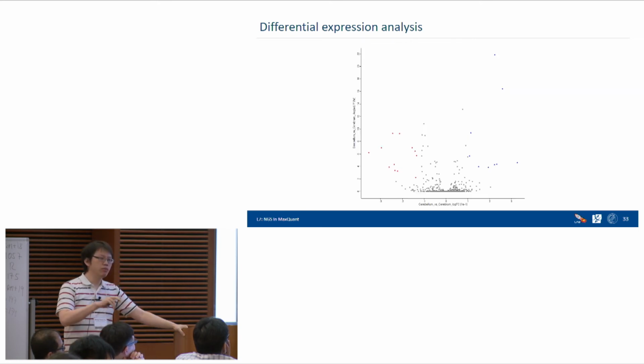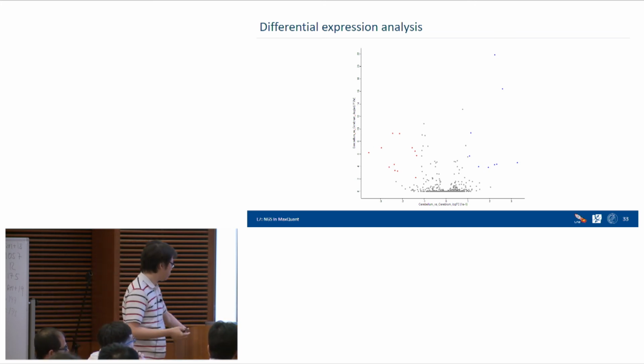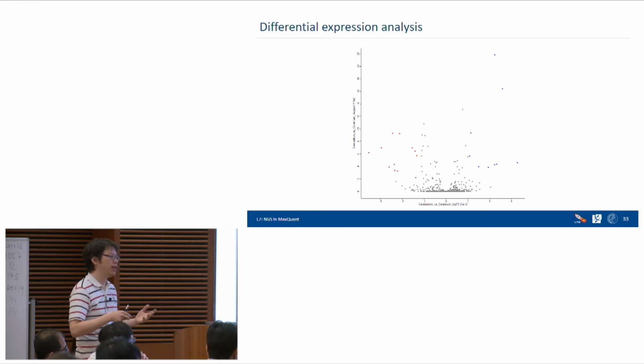Okay, and then we also can remove some genes which only have very few reads mapped on them. Normally, people set 10 or 20 reads. If not more than that, we will discard them because this actually is not expressed. Okay, after all these settings, you run the DE analysis, and then you can easily use a scatter plot to plot volcano plots.